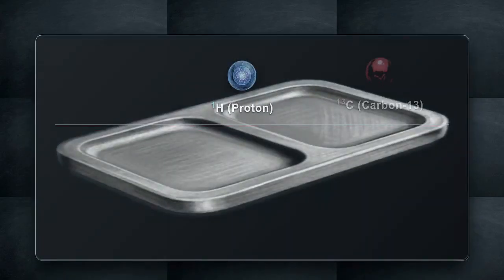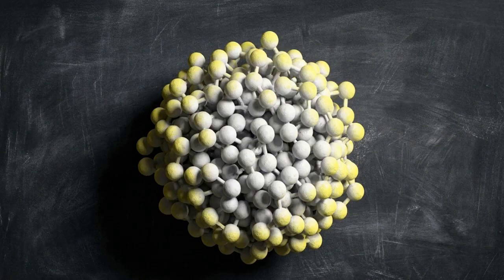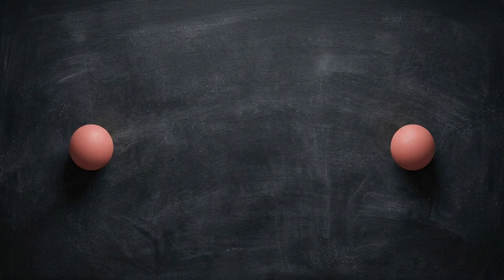This comparison matrix tracks the first major parameter, natural abundance. Almost all naturally occurring hydrogen is NMR active. A proton scan catches this abundance, producing massive signal strength almost instantaneously. Carbon is vastly different. Nearly 99% of it exists as carbon-12, which is completely NMR inactive. To the sensor, the vast majority of your molecule is invisible.